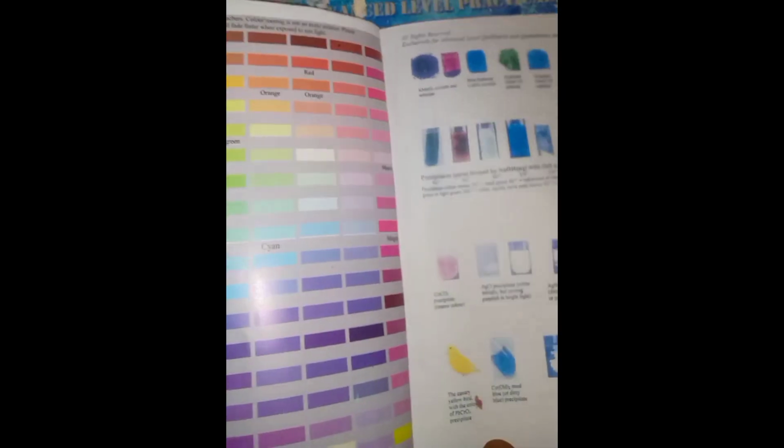Now in this case I'll simply open to where I have organic reactions, guys. Good. This is where I have them. That's the third sample, this third source sample. This is where I have it. Then it continues here as well. So guys, let's assume that I want to test for phenol. Good. So guys, I don't know if I'll make a video on phenol, because it's also important. Or 2,4-dinitrophenylhydrazine to test for aldehydes and ketones, or test for the carbonyls.